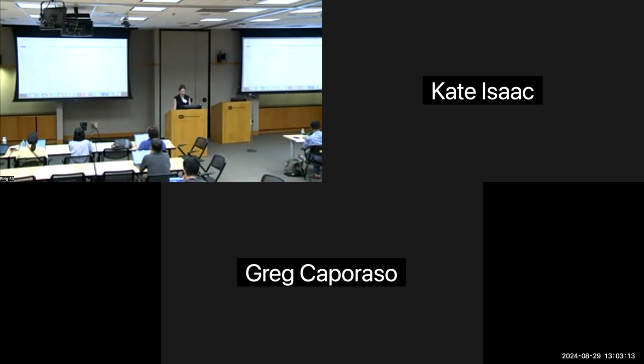Let's continue on. To make sure that I'm in the same place, I will LS. It may seem like a lot of LS, CD, LS, but you really just want to make sure, because if you're in the command line, you're not going to see these files on the side, so you want to print that out every time to make sure you are where you think you are. So I see my artifacts in here, and then I'm going to do my QIIME command. I'm going to do QIIME tools and then replay.